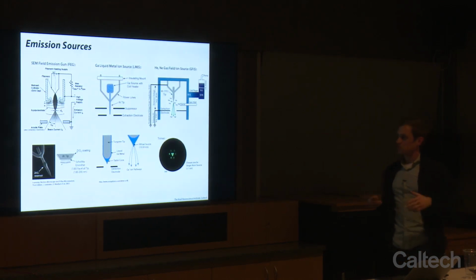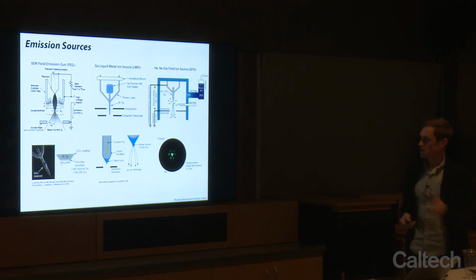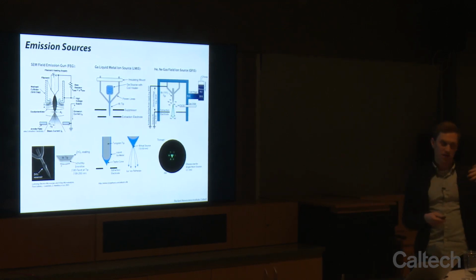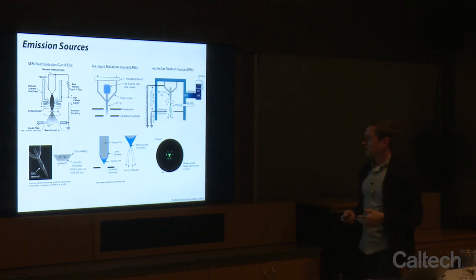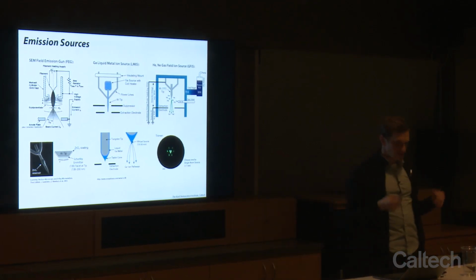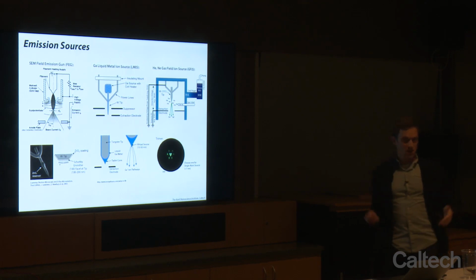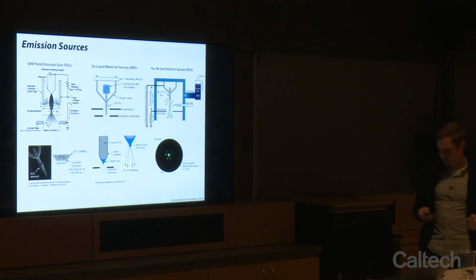And what I'm going to try to do over the course of these lectures is show the analogies between the 3 different types of microscopy. And here's a good place to start. These are the emission sources, and we'll see that each of them is a tungsten needle. And we'll have some kind of extractor, some kind of suppressor. We'll have an accelerating voltage setup, and we'll be able to draw analogies. So they all look a little bit different, and they have their own attributes to give emission of electrons or gallium ions or helium ions. They're all fundamentally of the same construction. And so this will be a core concept of these lectures, trying to draw analogies across the different microscope platforms.